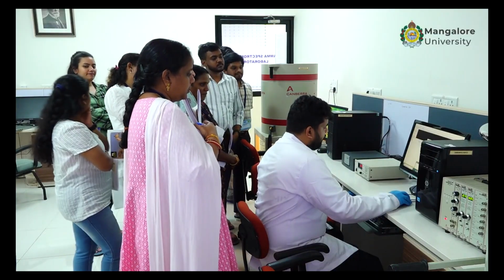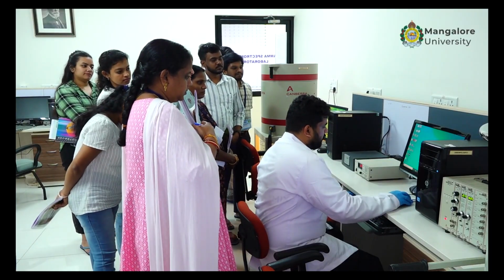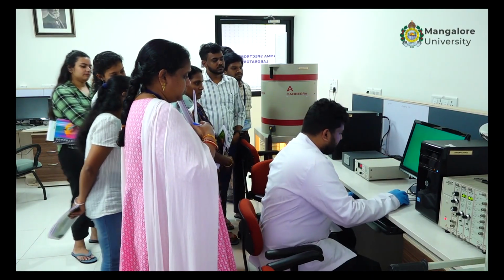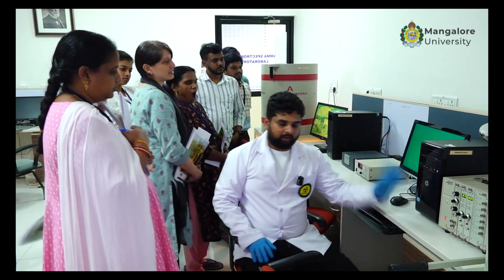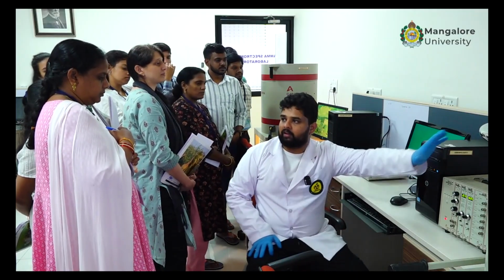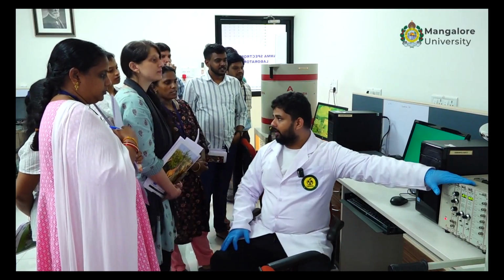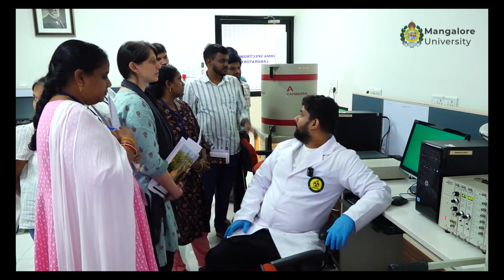I'll have to restart it. So actually there is something called VDM. That has to communicate. That is the communication link between your MCA and the setup and to the PC.